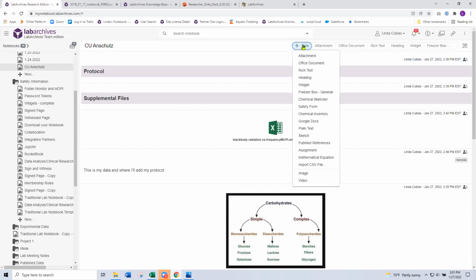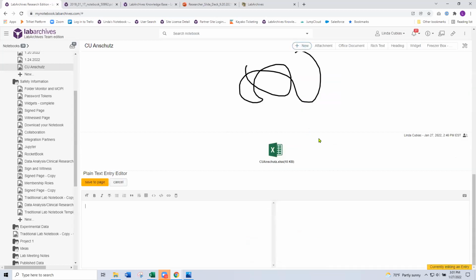So for example, if we go to our entry menu, you go to our plain text entry, it's really been created largely for the storage of code. It can also be used for markdown entry. So it's nice here too. You can enter in your markdown. You have a preview window that's available. So that's great for the storage of code. It'll create its own entry for that code.